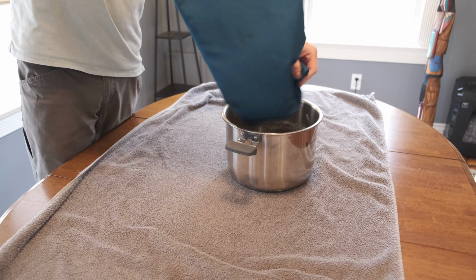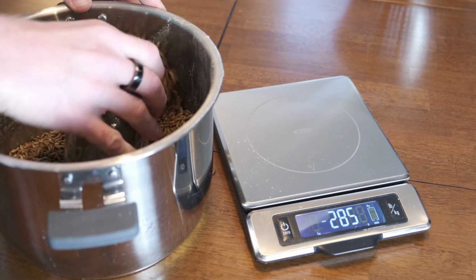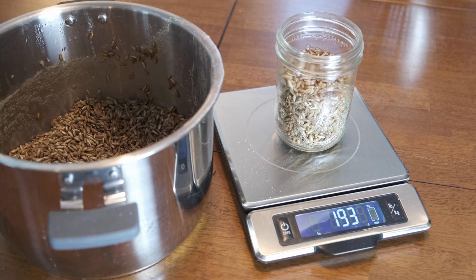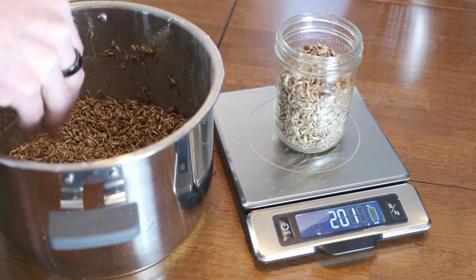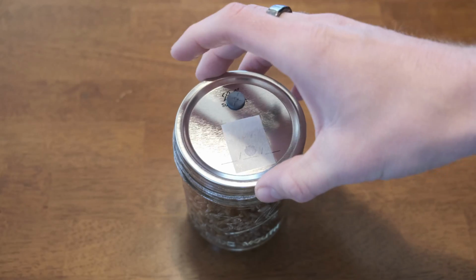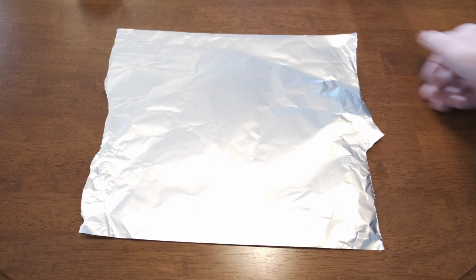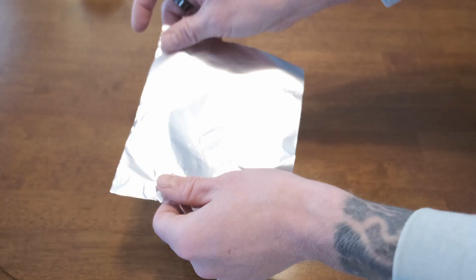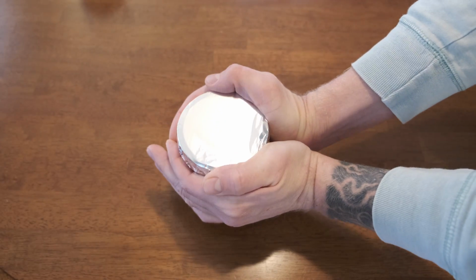From here, let's load the grain into jars and don't go more than about 3/4 full. Install a lid on the jars. Here I'm using my vented and plugged lids with a piece of micropore tape over the vent. And then I take a sheet of tin foil and split it into 4 sections. And then use each one of these quarters to cover the lid of the jar.